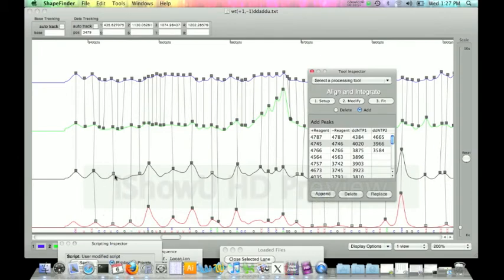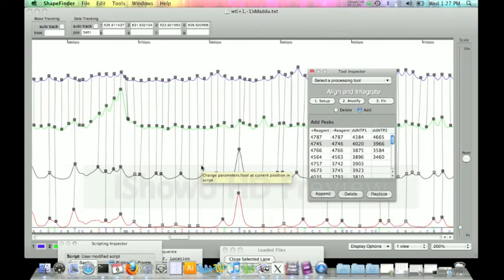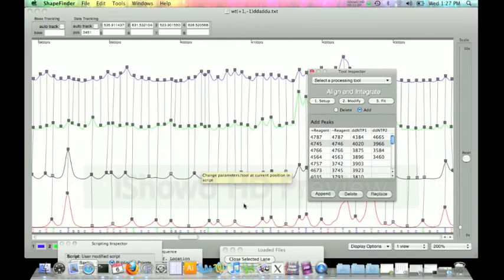We have a couple U's under here. So it's looking like our data is pretty well lined up with the ladders, and our sequence is also lined up with the ladders. And that's the important thing. So now we're going to go back. We can see that it's pretty well lined up along the bottom here.